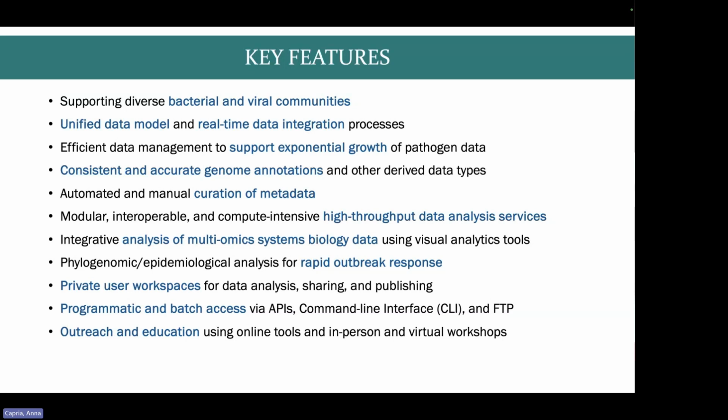All of our services are run on high throughput computation, so you have the ability to do modular, interoperable, and compute-intensive analysis, all from your web browser. So those analysis jobs are easily run from anywhere in the world, and you shouldn't be slowed down by not having access to high throughput computing.